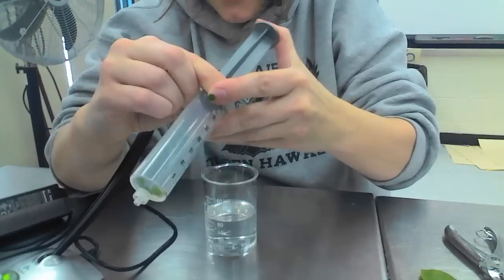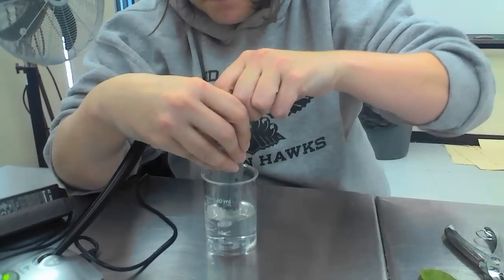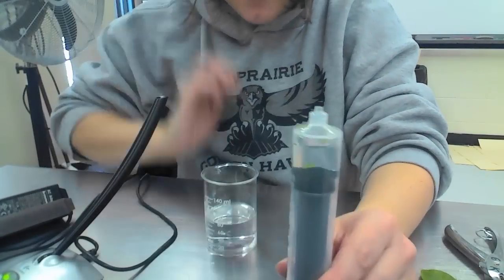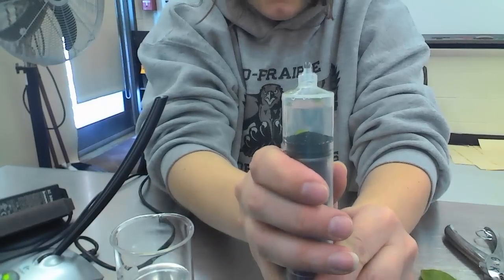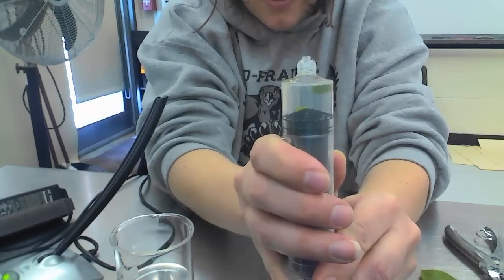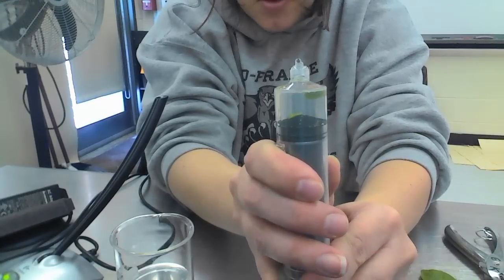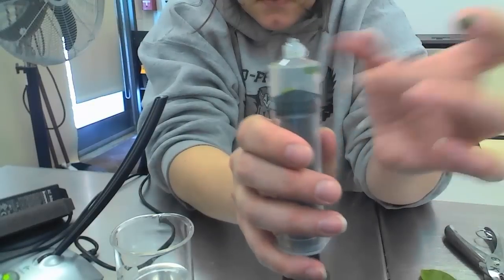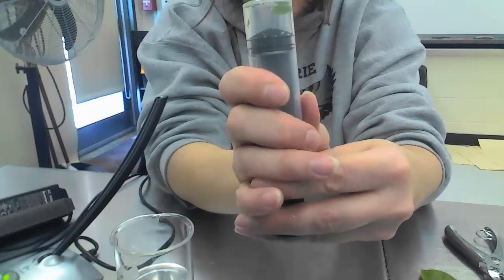And I'm going to put the syringe in. Now I'm going to get some water. Now what we want to do is get all this air out. As I said, the leaves have air pockets, so we want to get all the air out of that, and we're basically going to create a vacuum. So I'm going to get all the air out. You need to flick it a little bit to make sure you get all the air bubbles out.